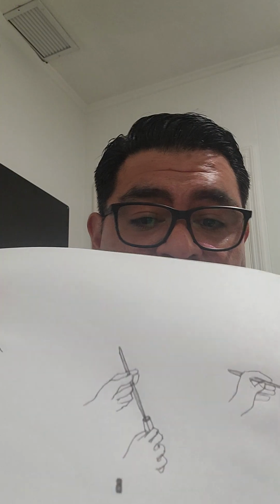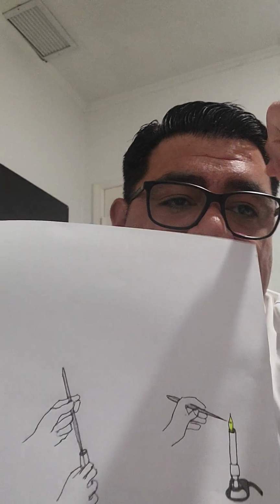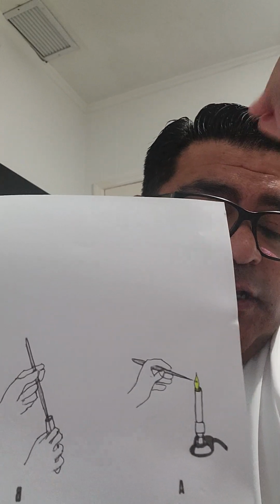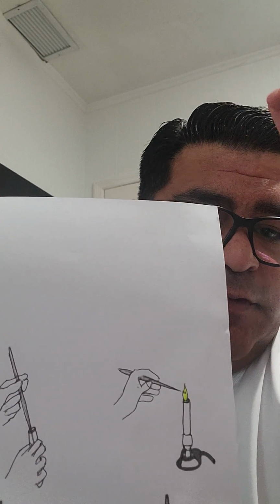Okay. Then we're going to move into taking the rod, and we're going to use, let's say, whether it's the ground or some kind of test tube, and we're going to collect the sample. Okay. And we're going to dip it in, move it around. Once we collect that sample, we're going to take it into a petri dish.